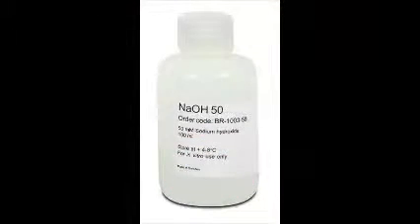Another potential error would be adding more base than needed. This would be an error because instead of neutralizing the acetic acid, it would be more basic.